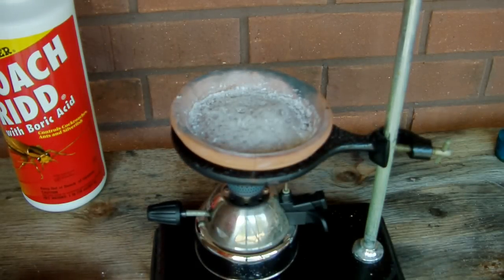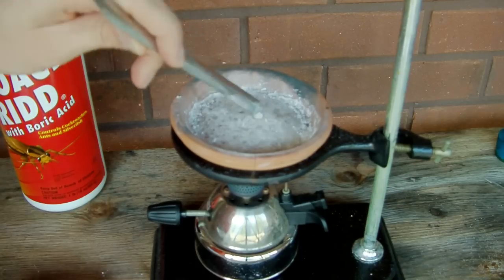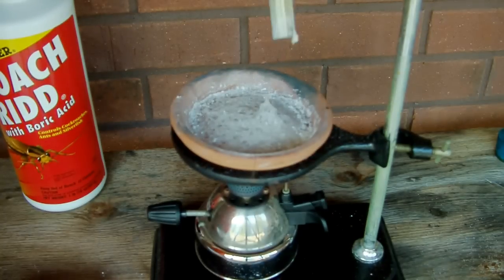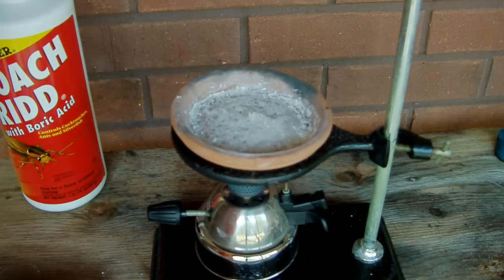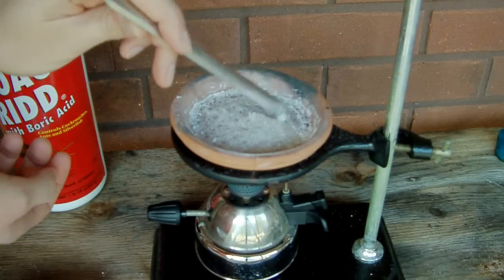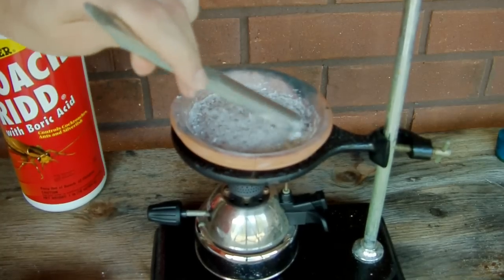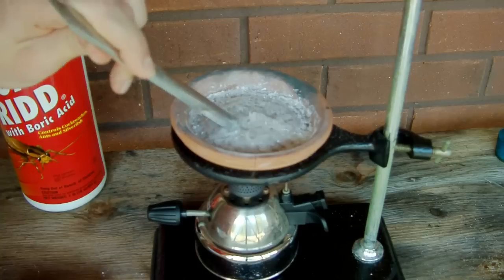It's been about a half hour since we started heating, and the off-gassing has slowed down significantly, which means most of the water has been driven off. What's left is just a really gooey, glassy substance, which is definitely going to stick to this plate. So I'm going to turn the heat off, let it cool back down, and try to scrape some of this together to avoid destroying the pot.